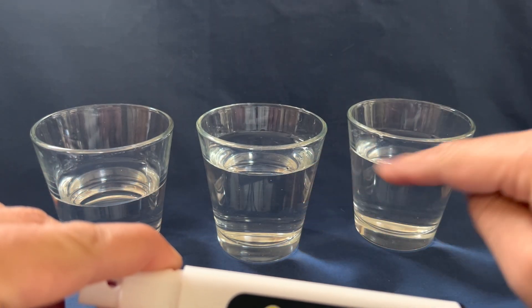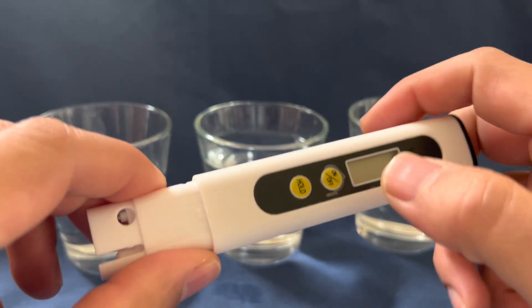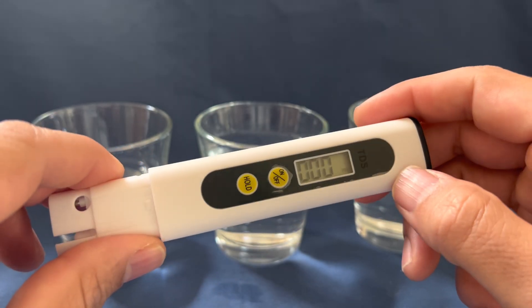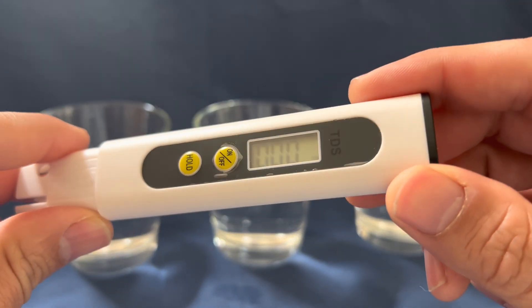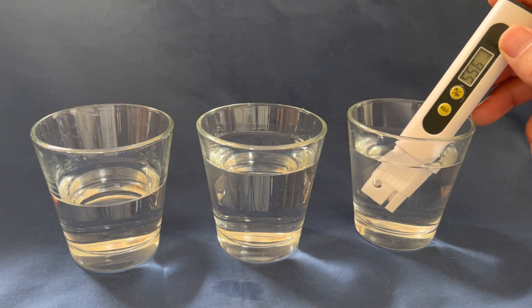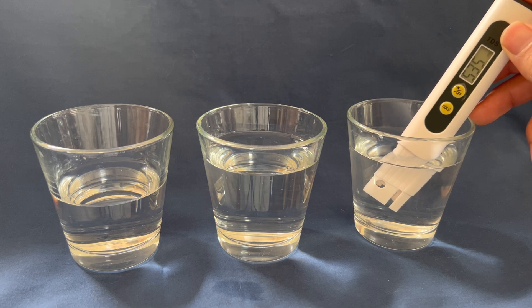I'm not sure which one of these is my tap water or reverse osmosis, but I suspect there's something wrong with it, which is why I bought this. It reads in parts per million, so we'll start over here — and we're reading 535.